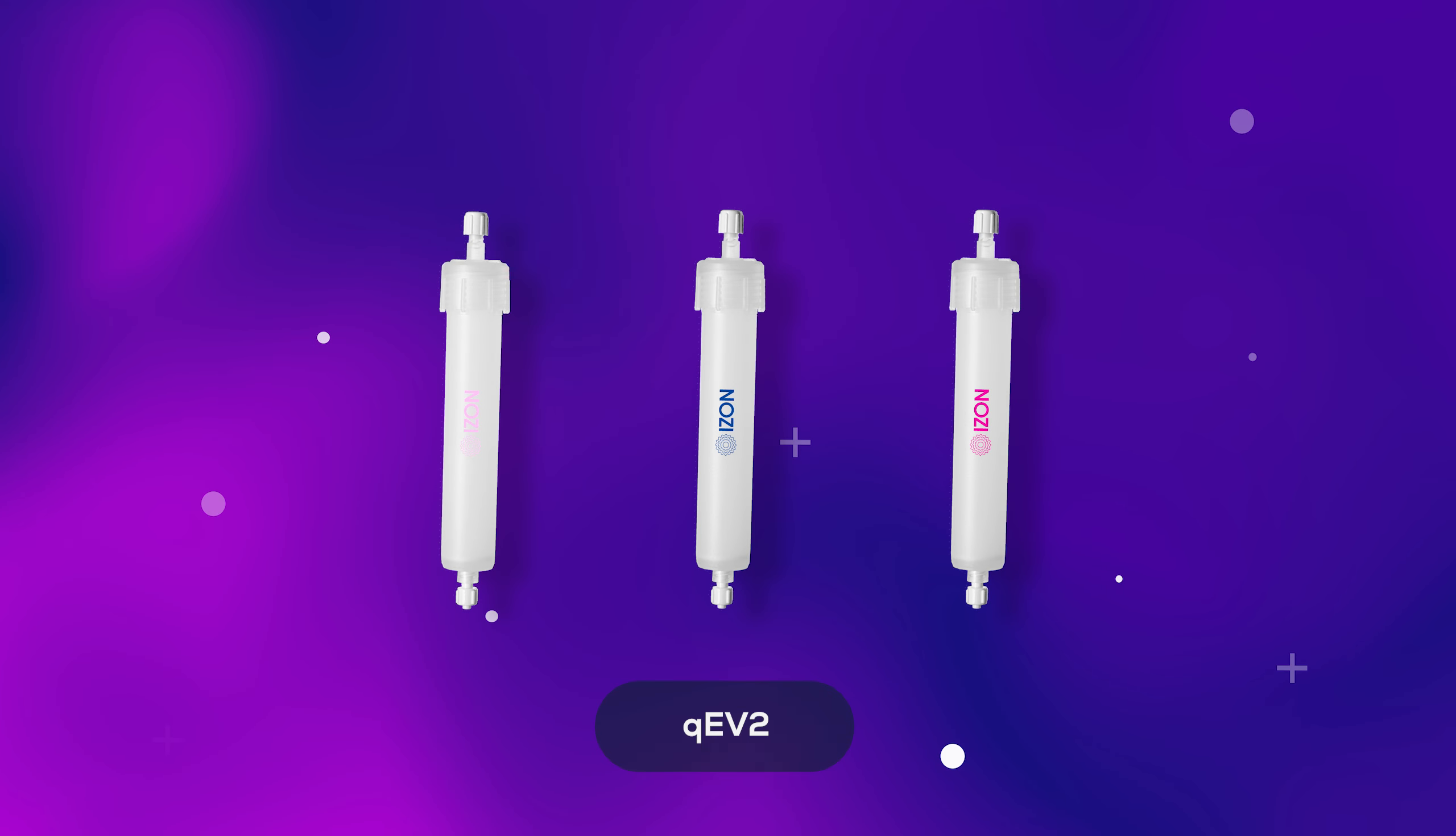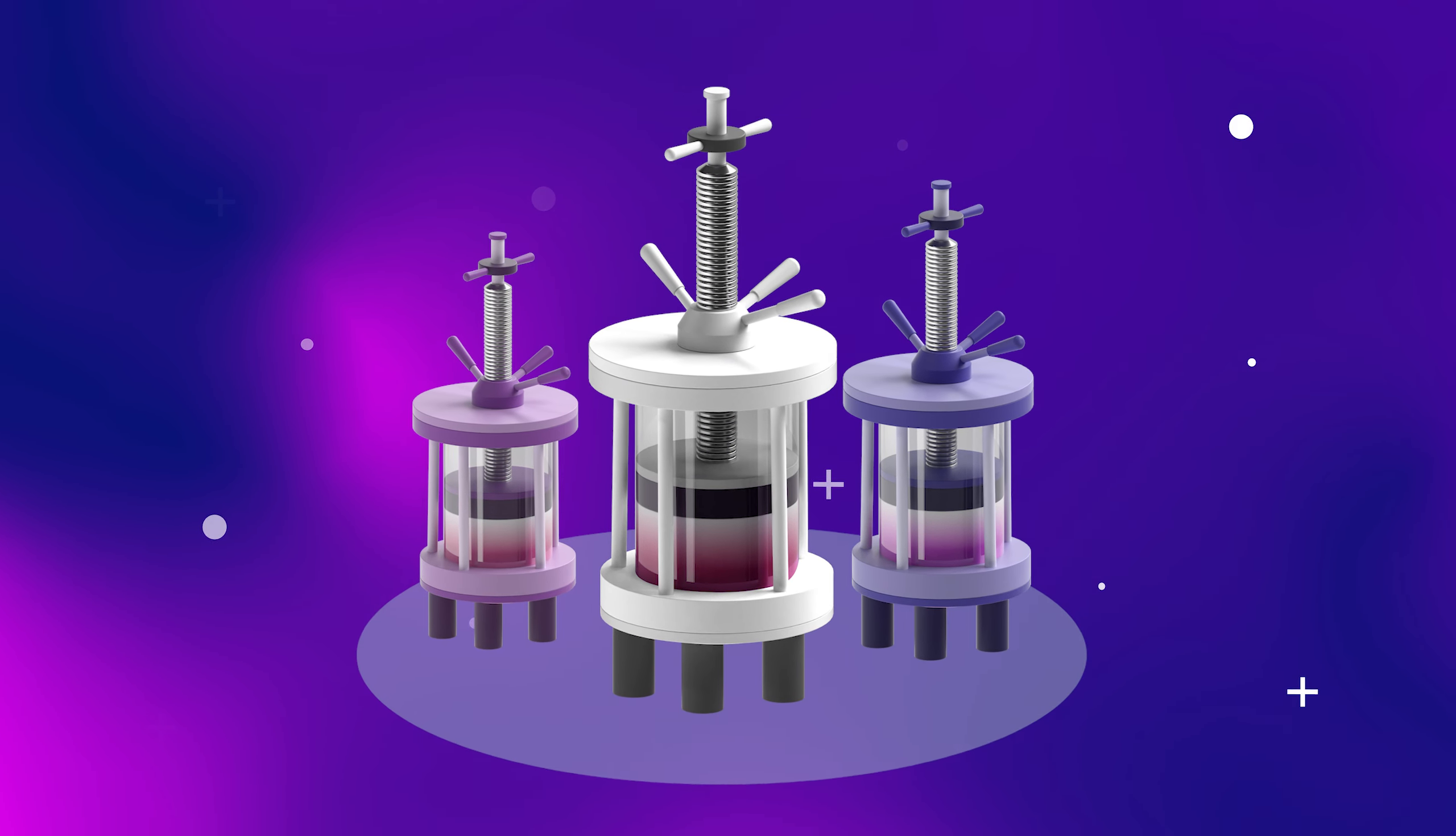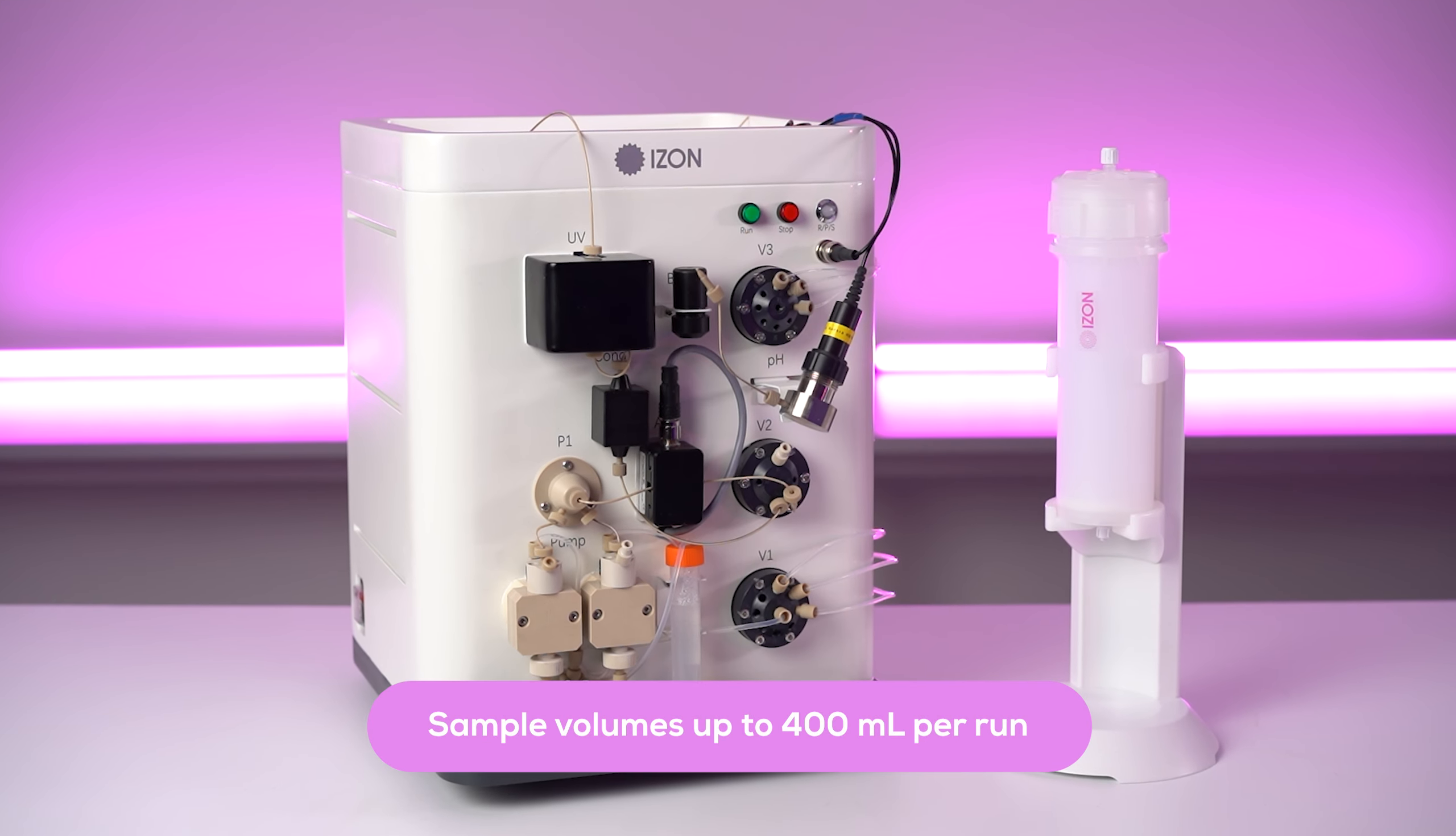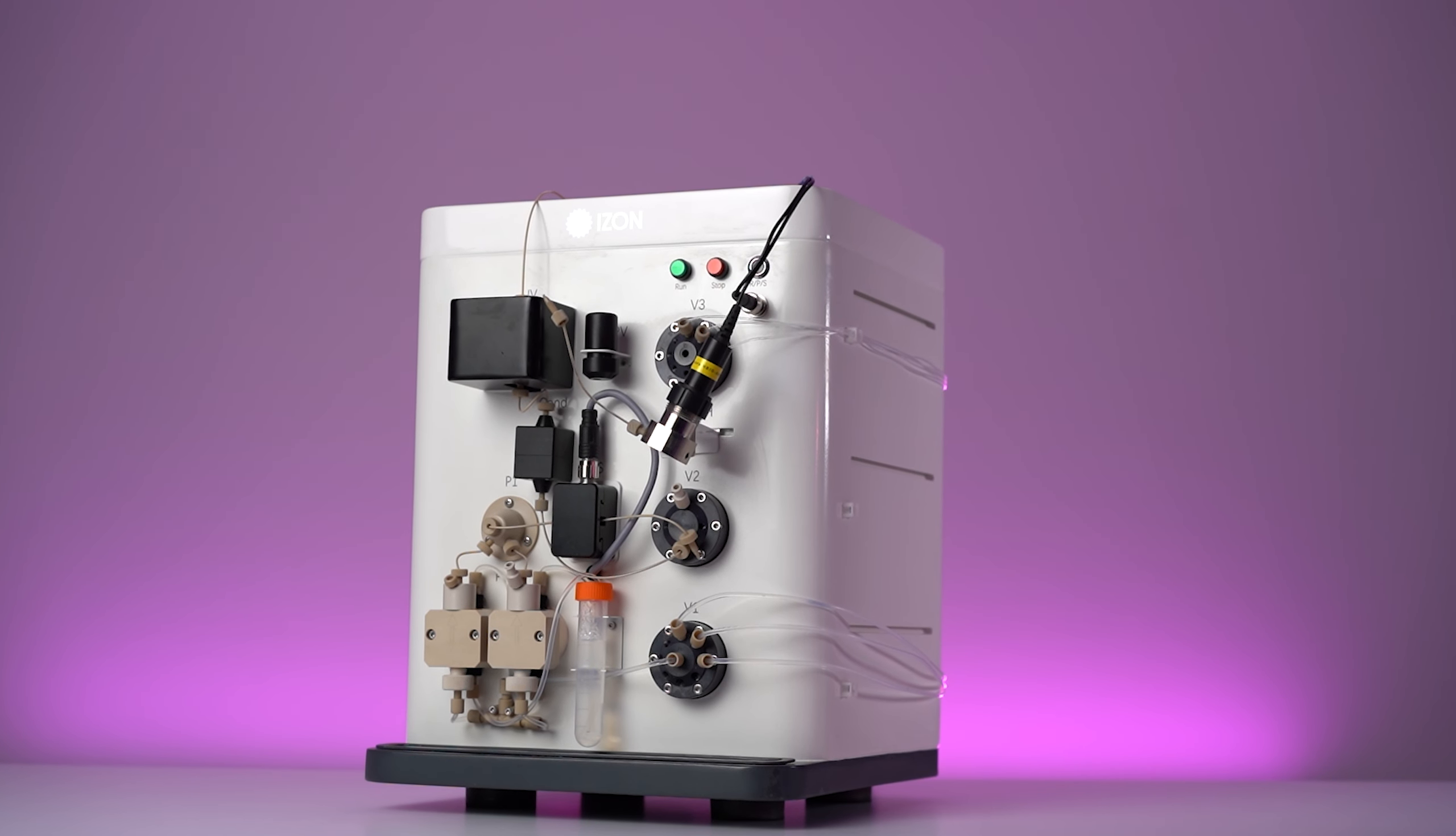Compatible with our larger QEV size exclusion chromatography columns, as well as our more industrial sized customized columns, the QEV Zinco accommodates a wide range of sample volumes up to around 400 milliliters.